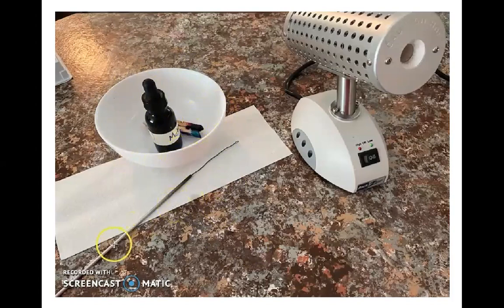I've also got my inoculation loop. This is an instrument that we use very often in the microbiology lab. It has an aluminum handle, and then it has a wire. And at the end of the wire, you can't really see it here, but there's a loop. When you dip this wire into a culture, into a broth culture, you will pull up some of that culture within the loop.